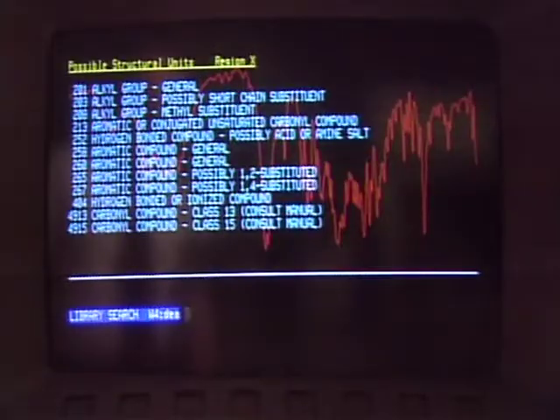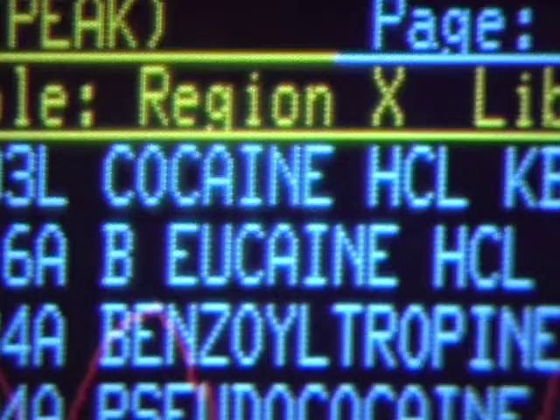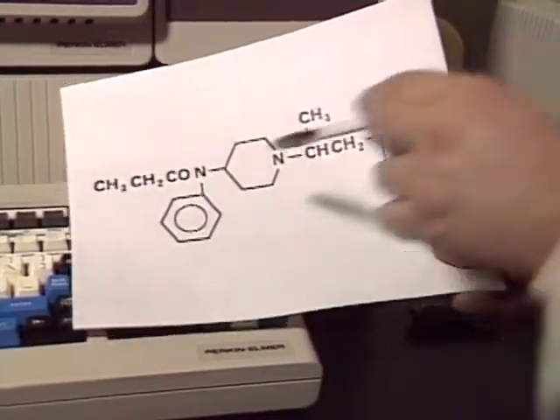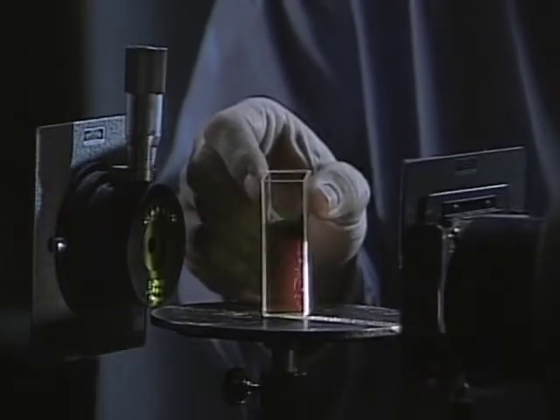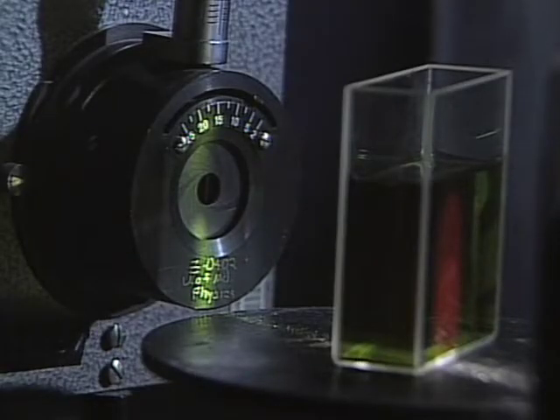Spectroscopy is used to identify substances by matching their spectral fingerprints with known spectra and to decipher the structure of previously unknown molecules. Whatever the use, all spectroscopic analysis is based on the same principle, that molecules can produce their own signals from within.